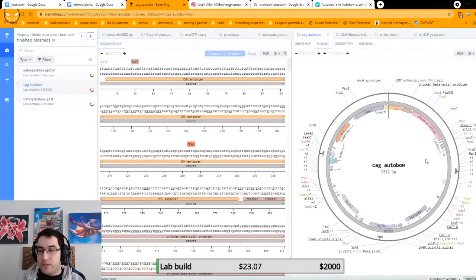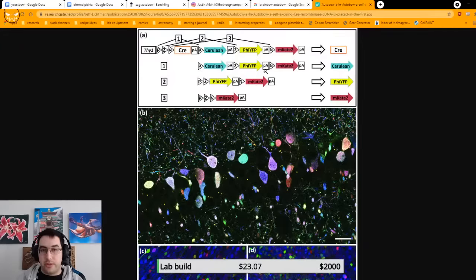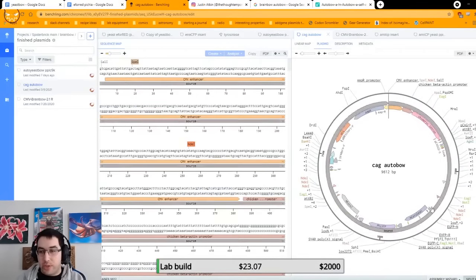So this is CAG Autobow. This is the doodle that you put in the paper. This is what it actually looks like. This has all the extra stuff in it that actually makes it work. In here, the Benchling, for whatever reason, didn't like one of the labels. So Cre is actually in this spot. It's just not labeled at all for some reason. Don't know why, just is.